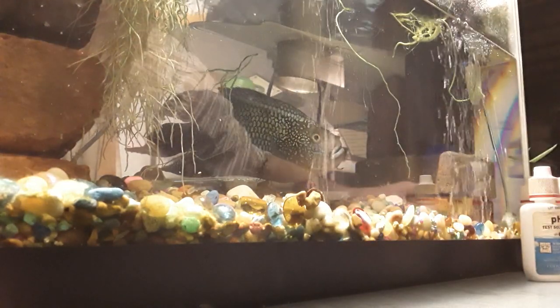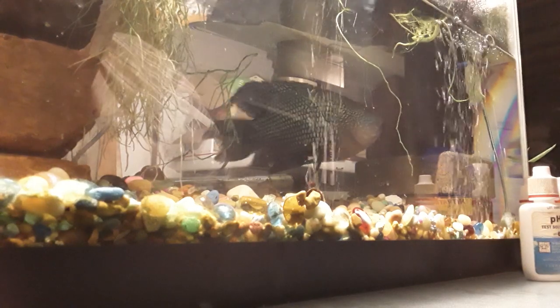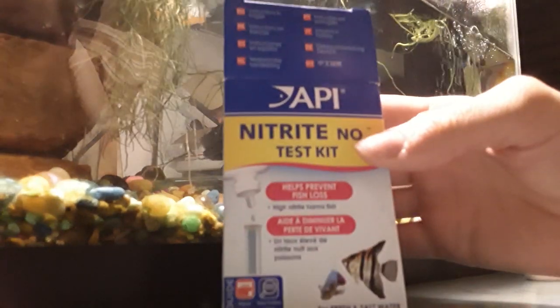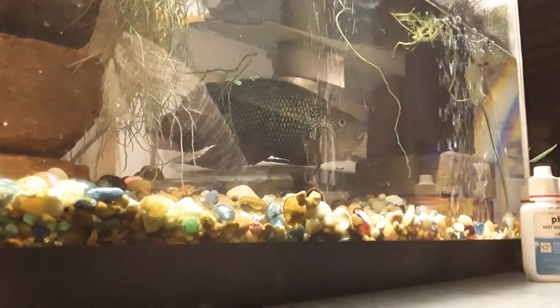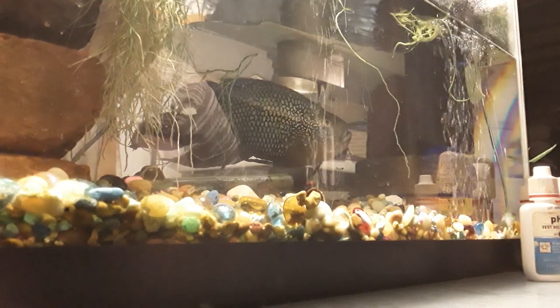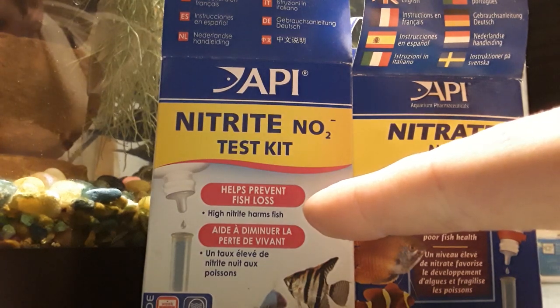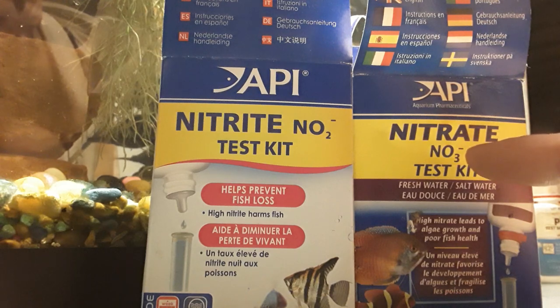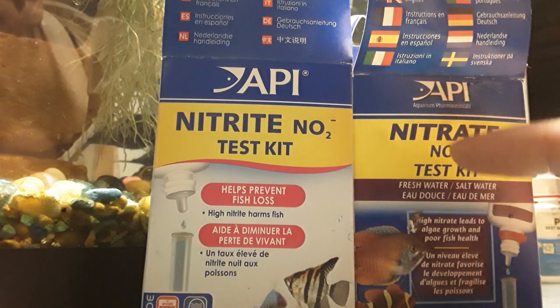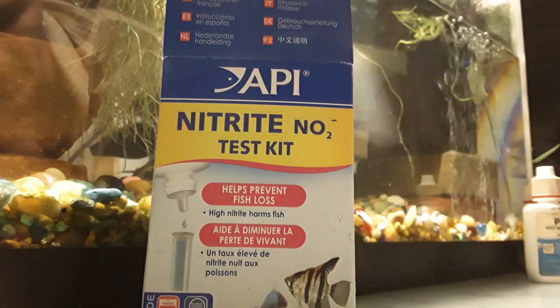Now the next test I'm going to be doing is nitrite. Now the difference between these: nitrite is dangerous for fish, while nitrate is not so dangerous — nitrate helps plants grow. Having nitrate in the water from my last test is not a big deal.